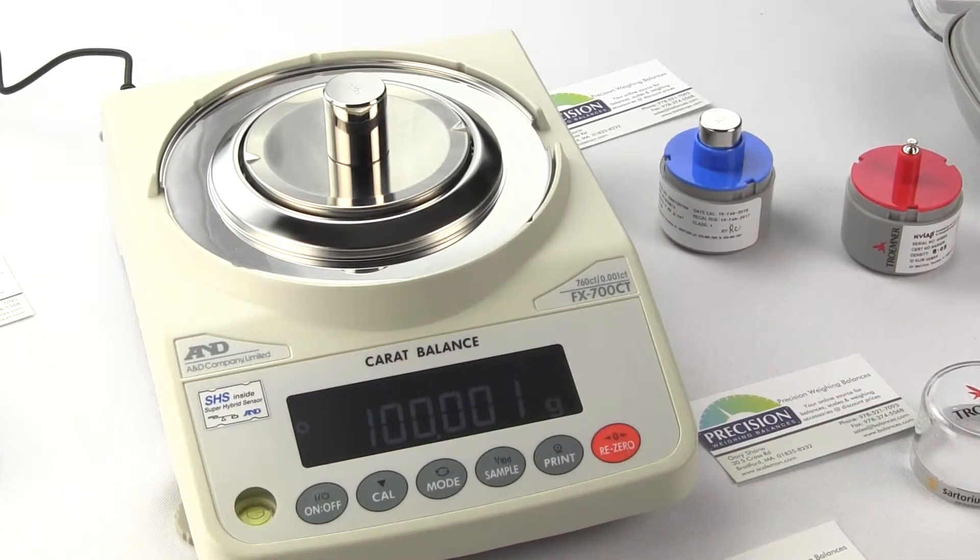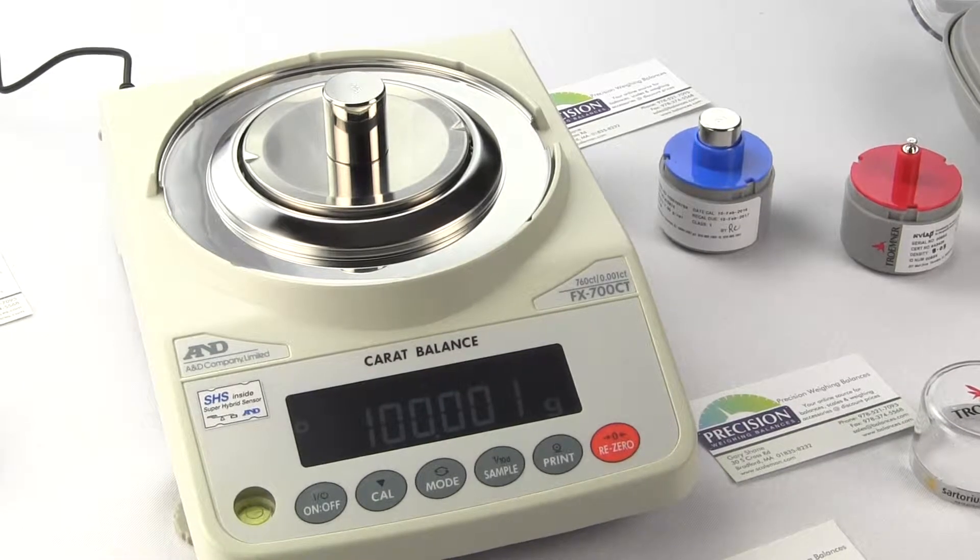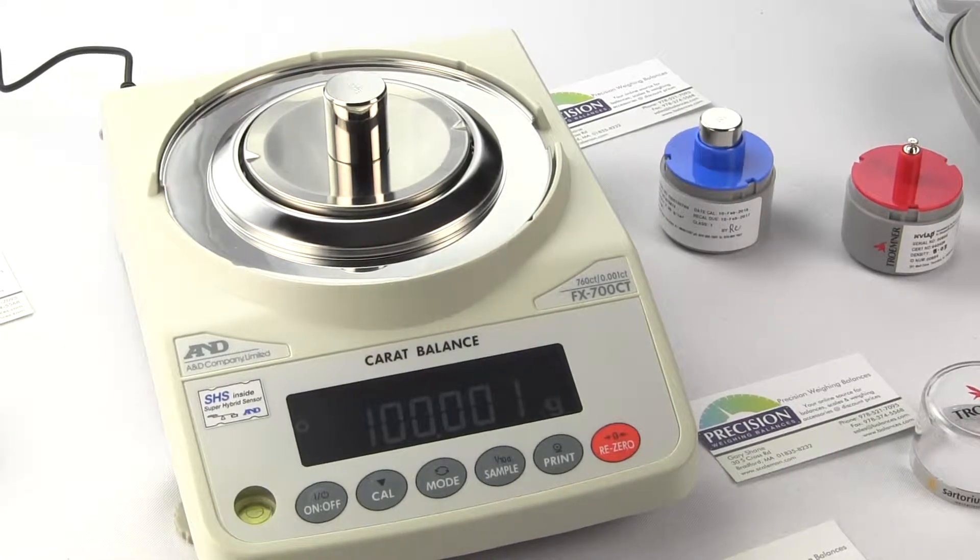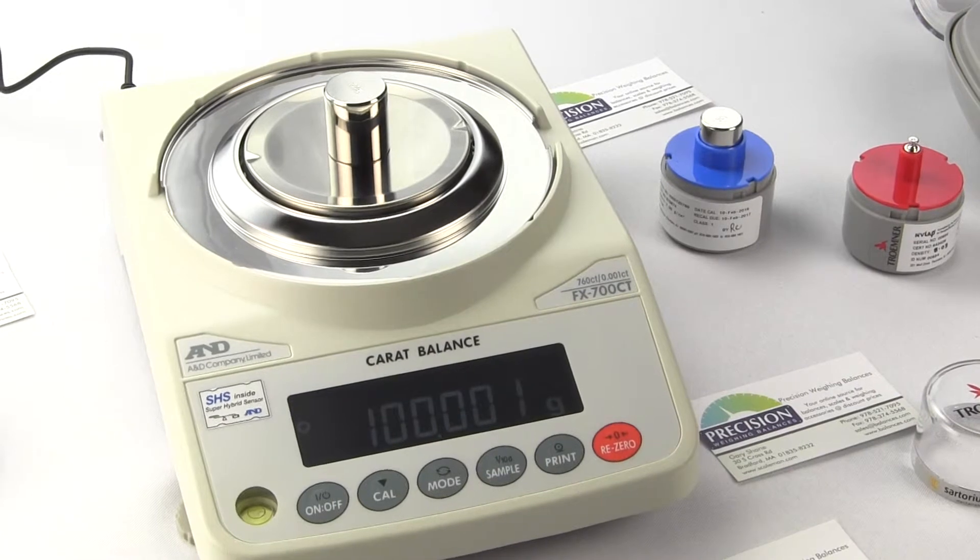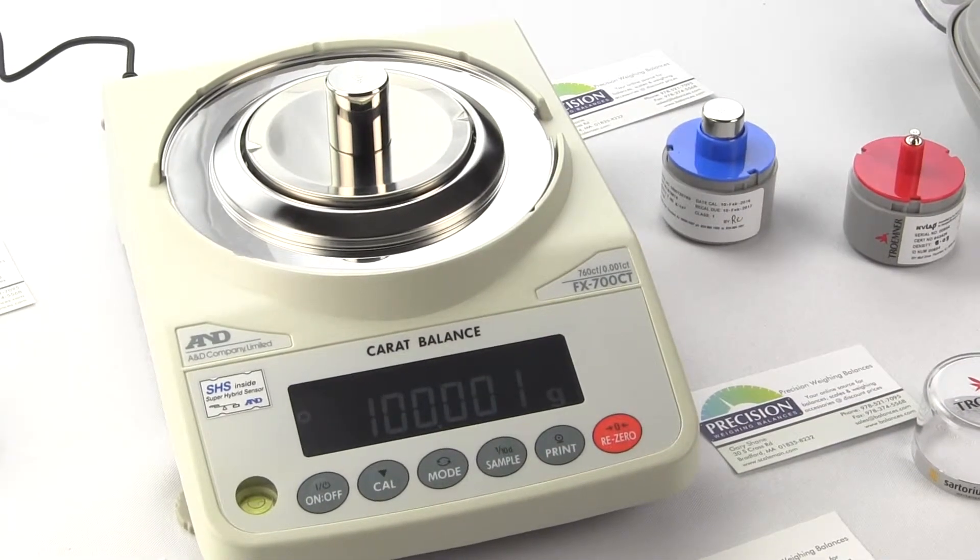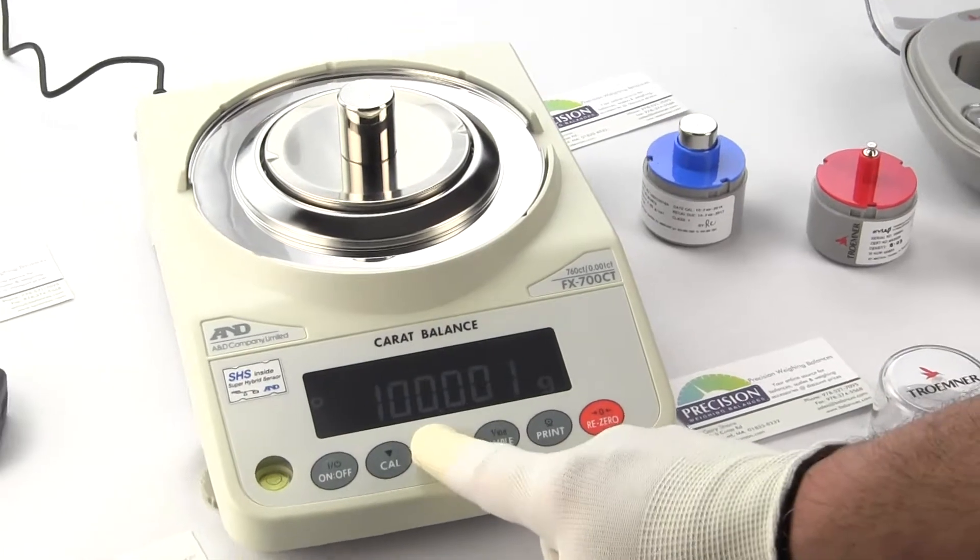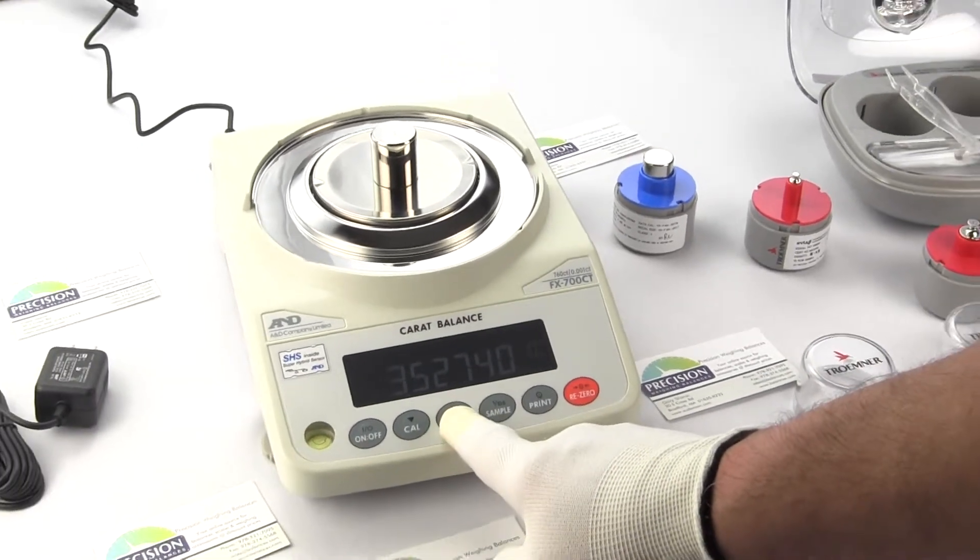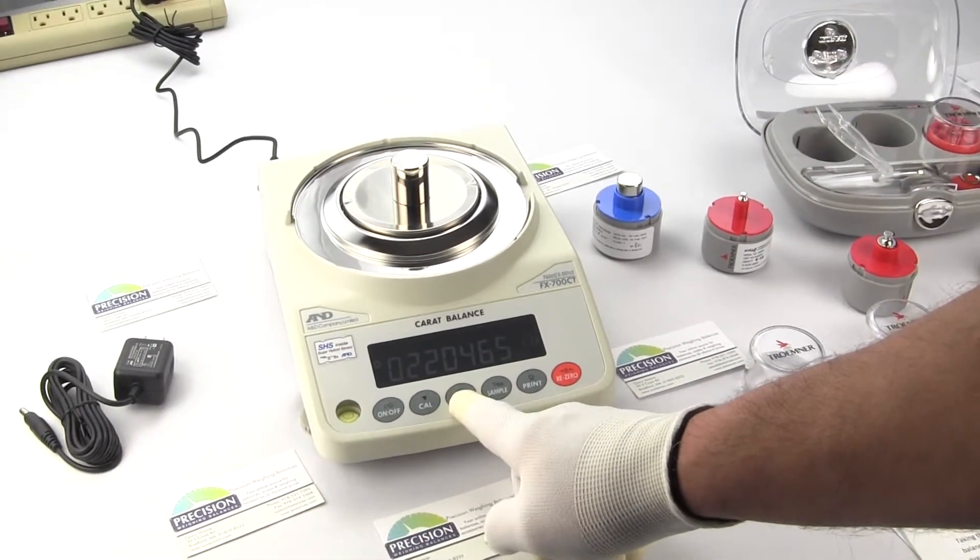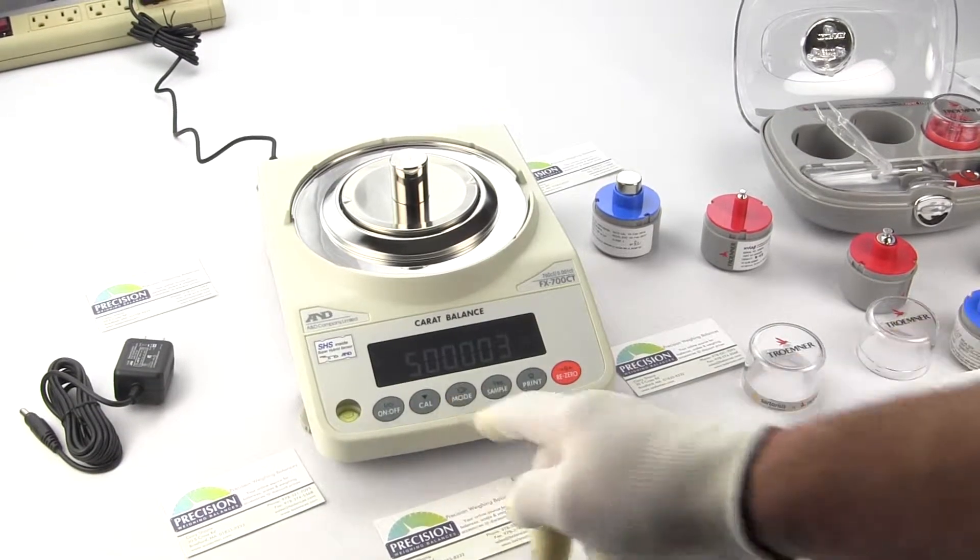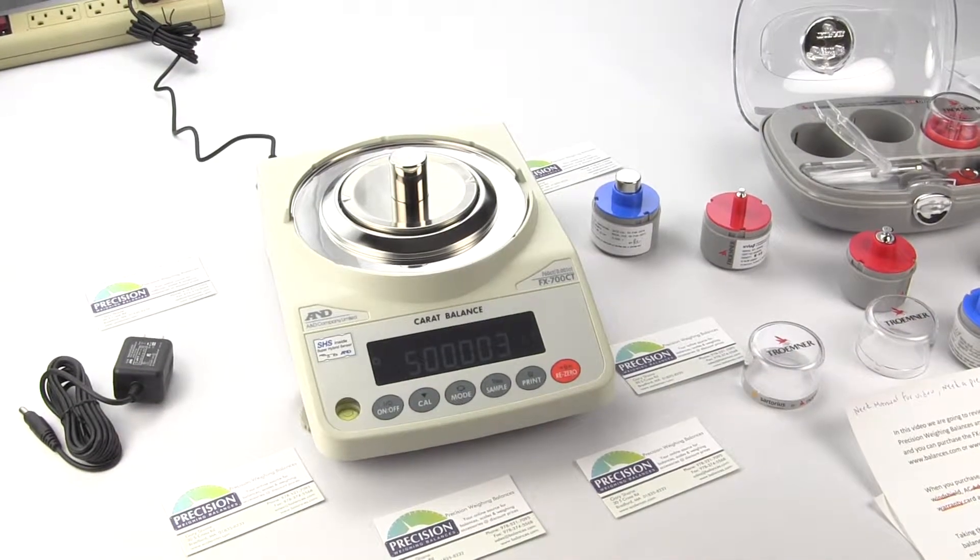If you are a jeweler and you're weighing lots of gems and precious stones you can weigh up to 700 carats with the FX700CT and the balance increments in 0.001 carat.